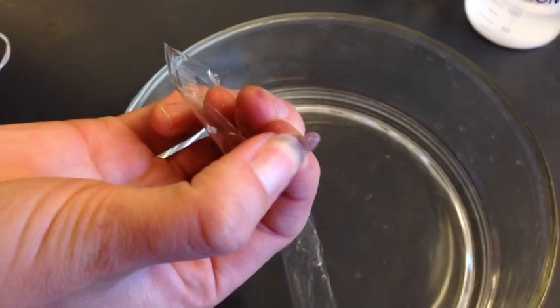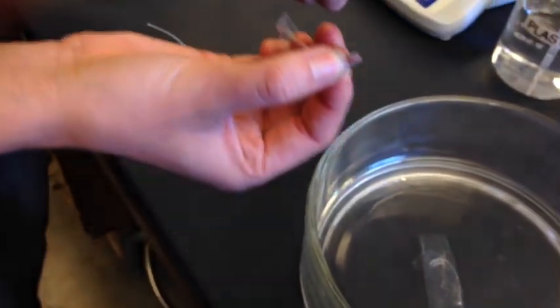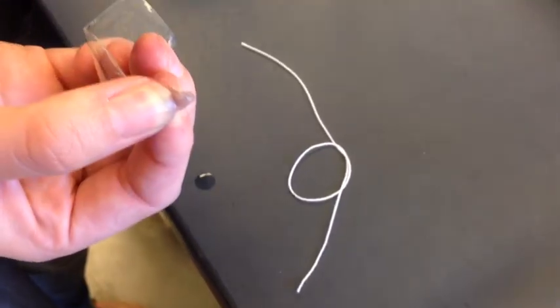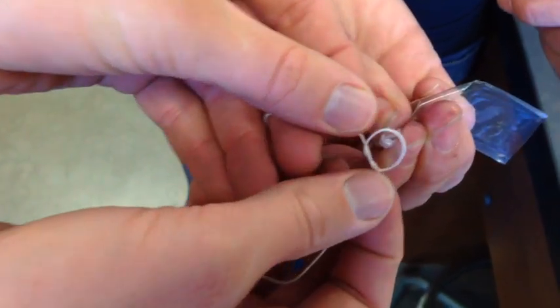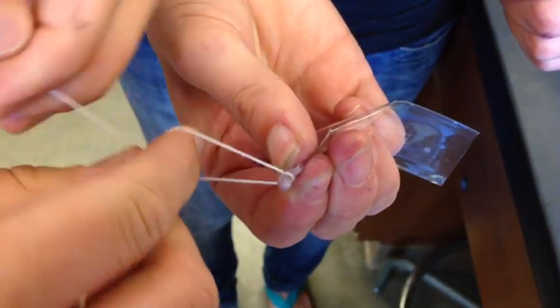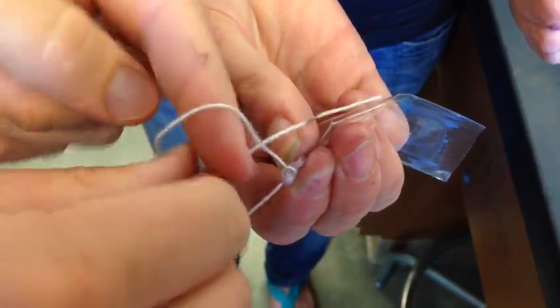Tie it off with a piece of string. It's best to start with the string already in a loop, which makes it easier for your partner to tie around the nub. The partner will loop it around and tie it very tight to make sure there are no leaks.